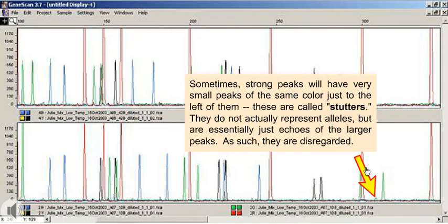Sometimes strong peaks will have very small peaks of the same color just to the left of them. These are called stutters. They do not actually represent alleles, but are essentially just echoes of the larger peaks. As such, they are disregarded.